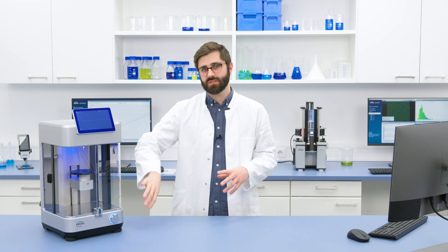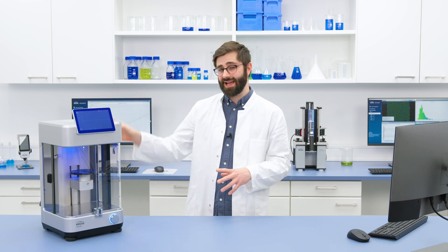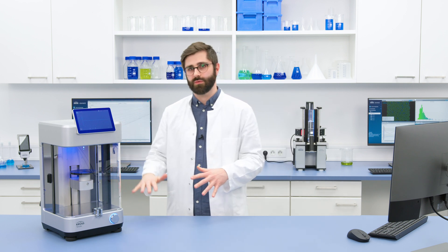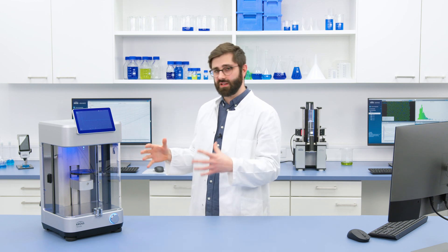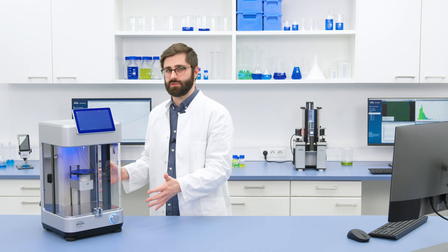Straight away, just at looking from the outside, it's clear that Tensio has been designed from the ground up to be ergonomic and easy to use and is a perfect fit for any lab bench.